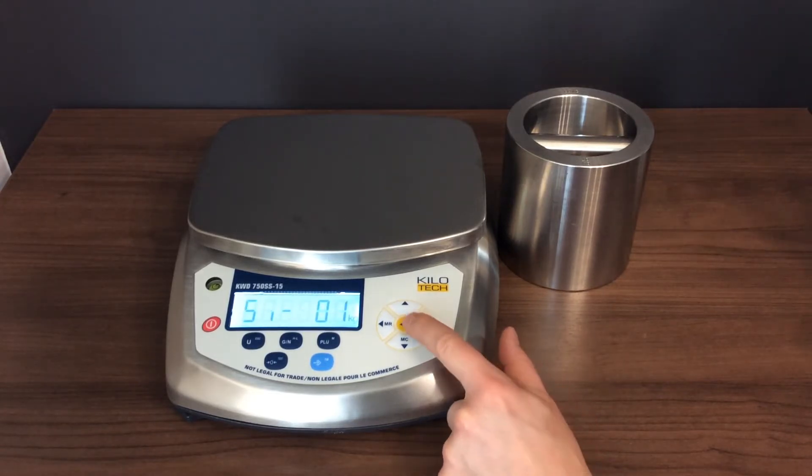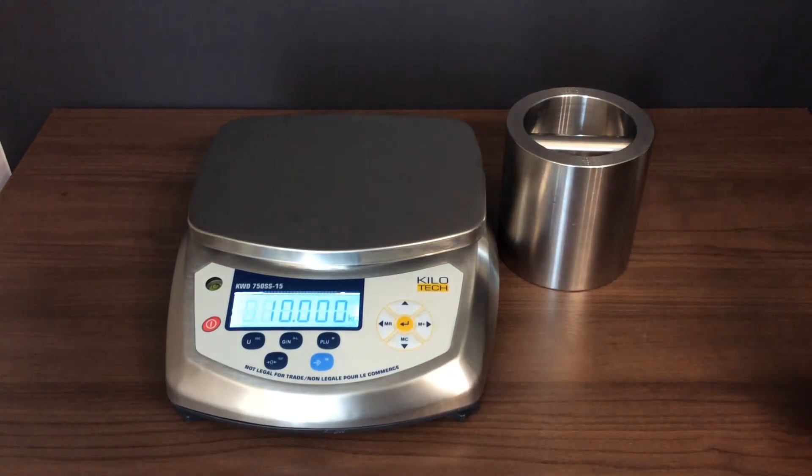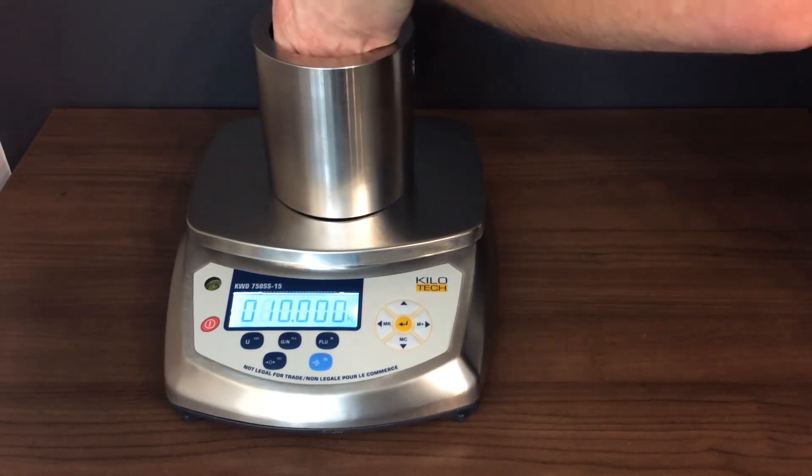Press ENTER. The LCD displays the previous weight used for calibration. You can change it by pressing the arrow keys. Place the weights on the platter and press ENTER again.